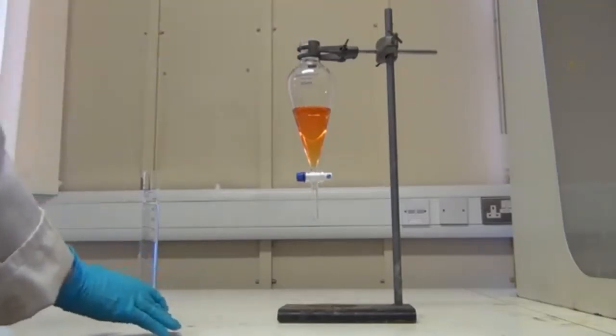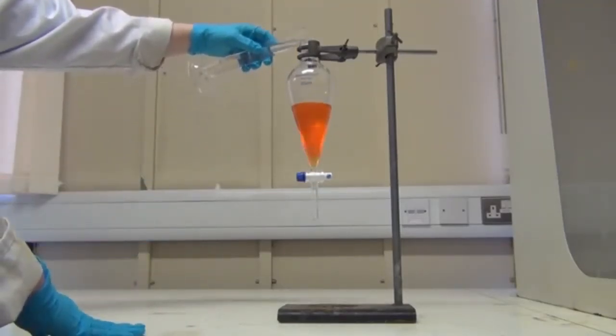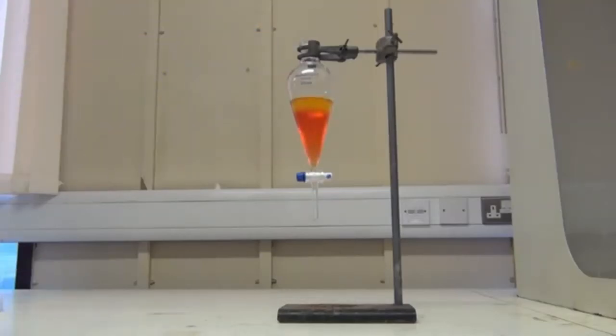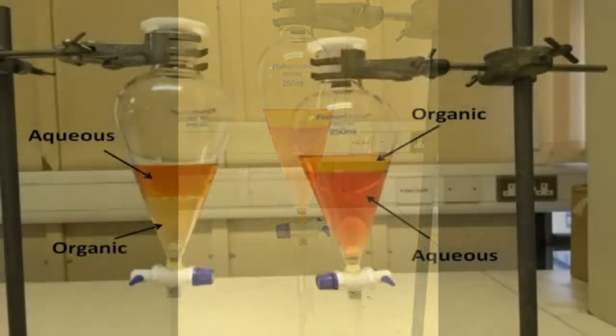When both the solution and the extraction solvent have been added, layers will begin to form. One layer is the aqueous phase and the other layer is the organic phase. Here we added colour to the aqueous and organic layers to show the separation more clearly, but it is more common for both layers to be colourless. The key to the separation of layers in a separating funnel is density. The bottom layer is the more dense solution, but this is not always the aqueous phase.